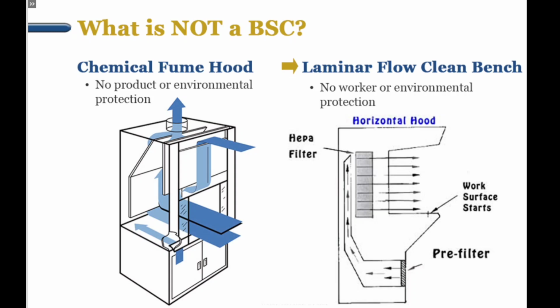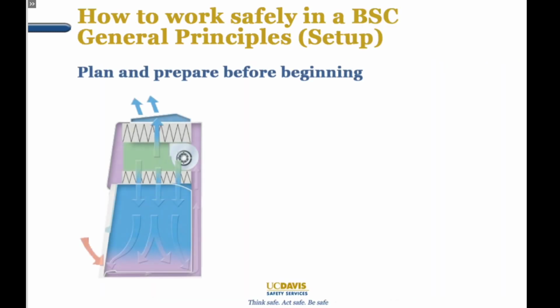Therefore, it is imperative that you never work with anything hazardous or biohazardous on a clean bench. Since correct airflow through the BSC is essential for product and personnel protection, it is very important while working in a BSC that the air curtain is disrupted as little as possible. The first thing we can do to help avoid disruption of airflow is to plan your experiments carefully.